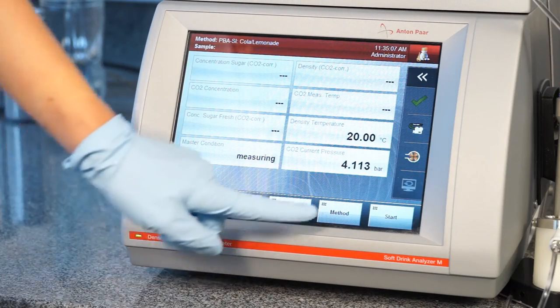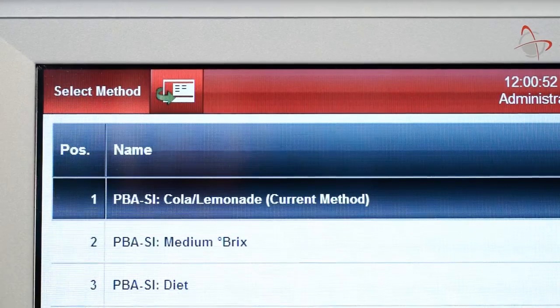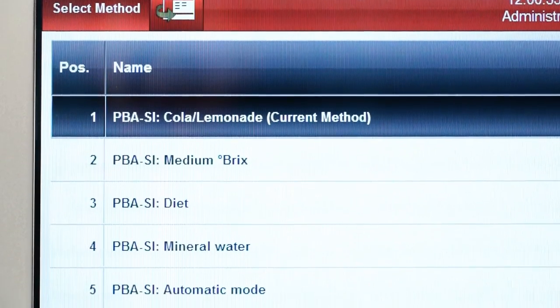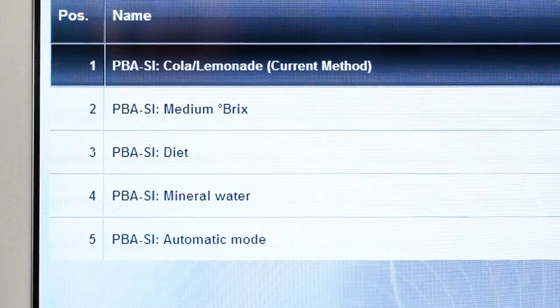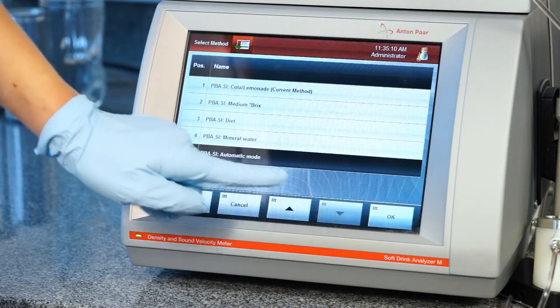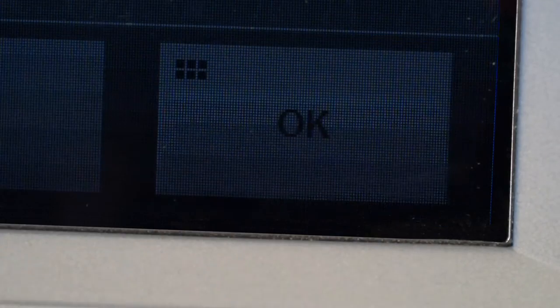The sample is prepared for the transfer. Now select the appropriate method, depending on the sample type which is going to be measured. Once the method is selected, you are ready to start the measurement cycle.